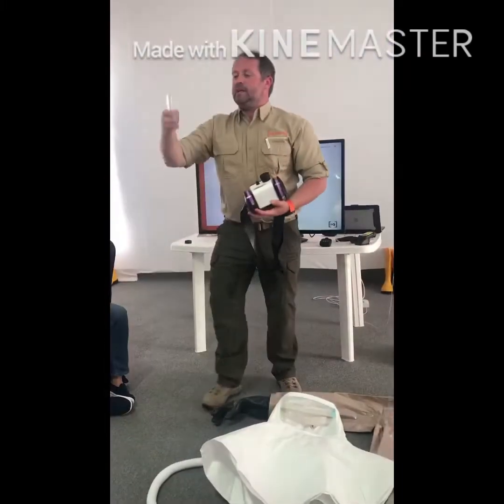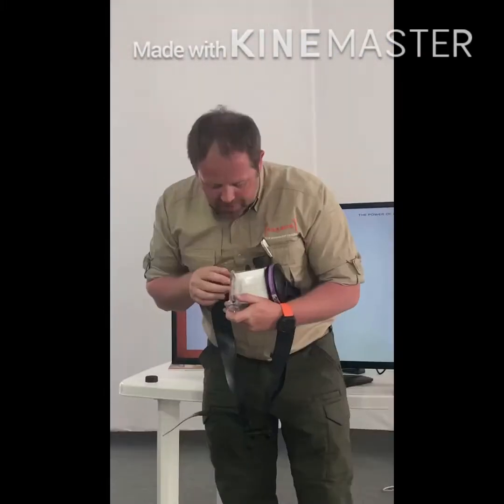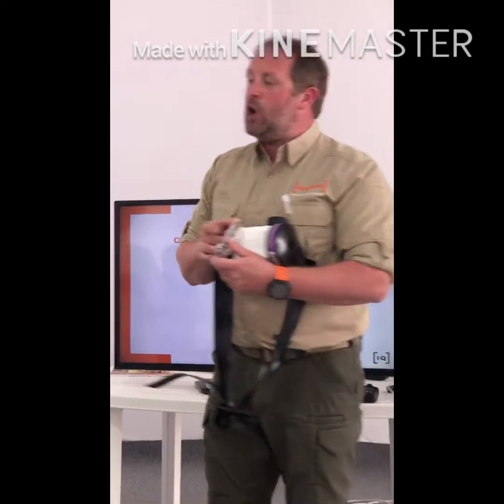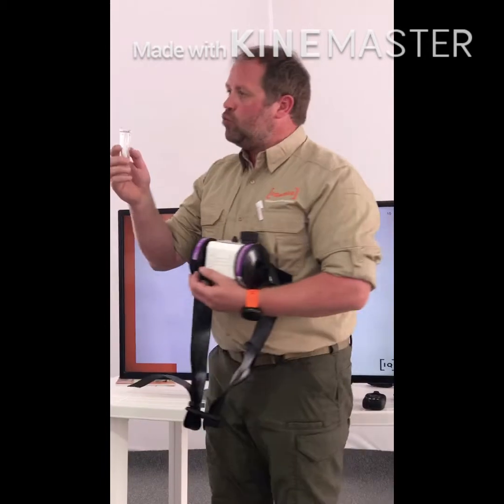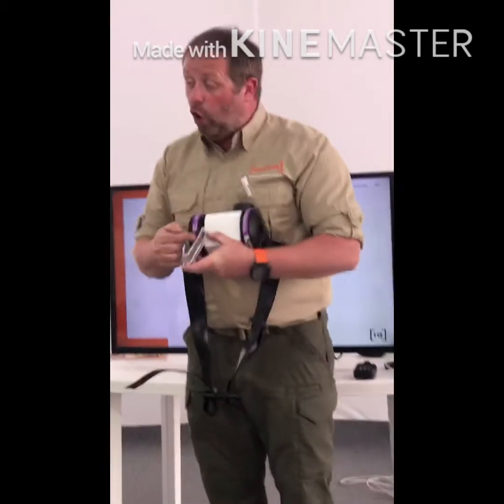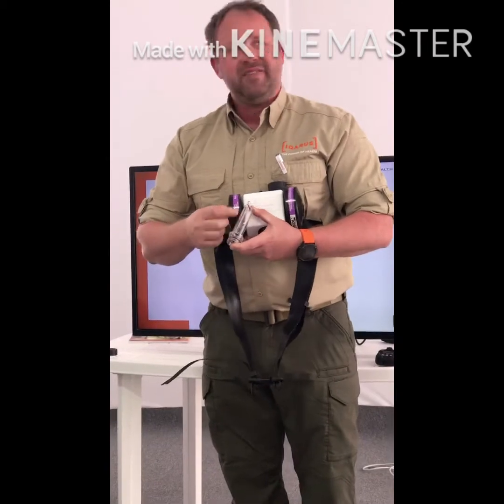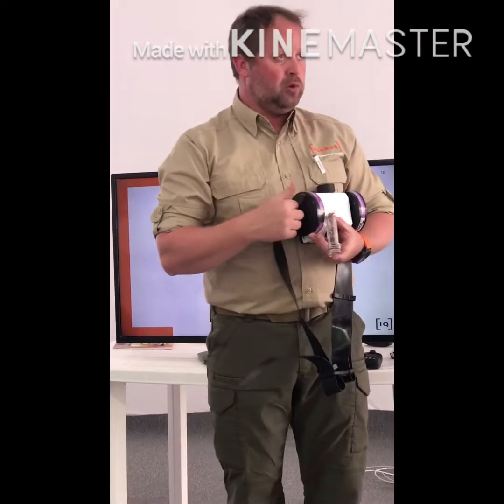I then need this thing, which is an air pressure tester. There are two lines. One says 4 CFM and one says 6 CFM. That means cubic feet per minute. Okay? What that means is I'm getting the right amount of air. At first check, I always want it above 6. Because if I've not started yet, I want it at its highest possible. That's going to degrade over time as the battery goes down or our canisters become full.